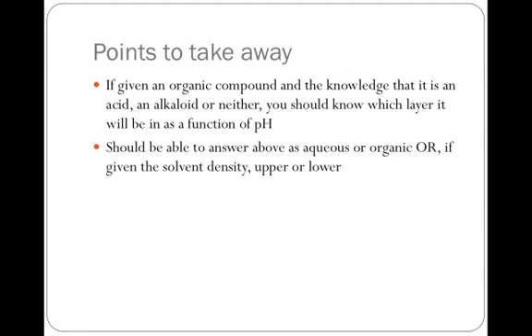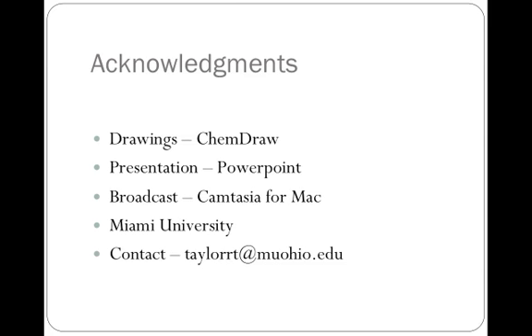And so all of those things are going to be easily discerned by you based on the content of this particular presentation. At this stage then, you should be able to understand in a given reaction why you're doing an extraction, where the compound you're interested in is going to be, organic or aqueous, top or bottom, and be able to work through all of that as you process reactions and learn more about chemistry.